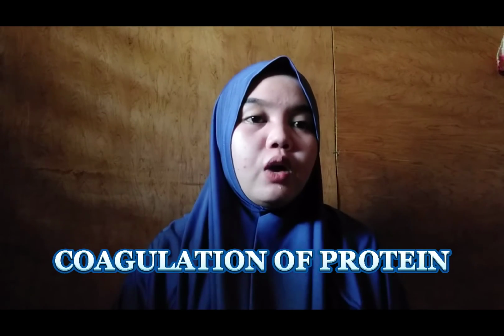The first test is the coagulation of protein. We have three tests: the heating, HNO3, and ethanol, and give only your observation in each test. Procedure: separate the yolk of an egg from its white, place them into the beakers, then add the same volume of water to each and stir it. Then heat it and observe.